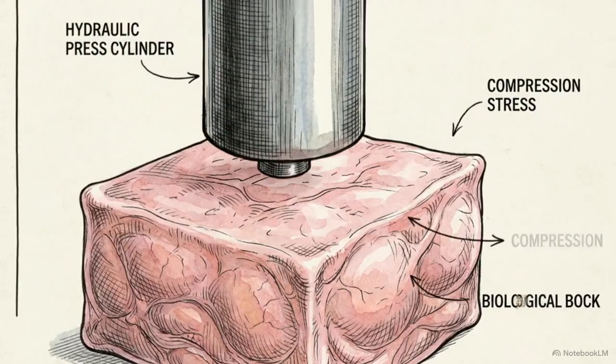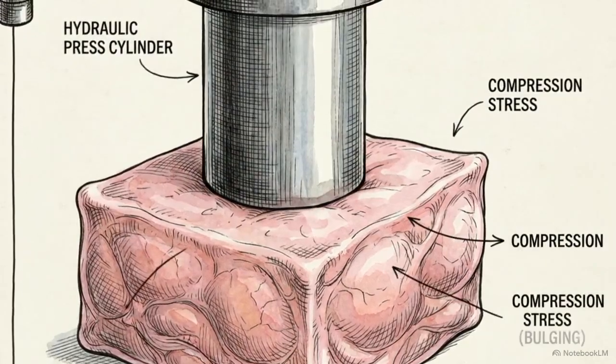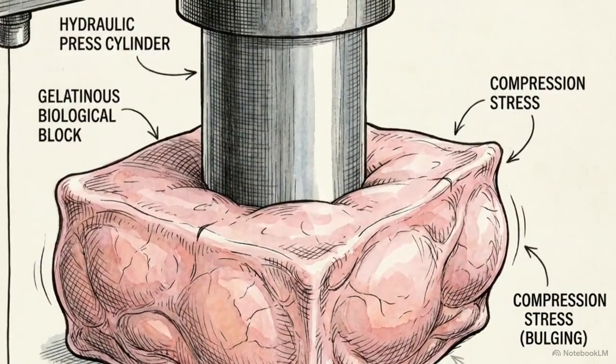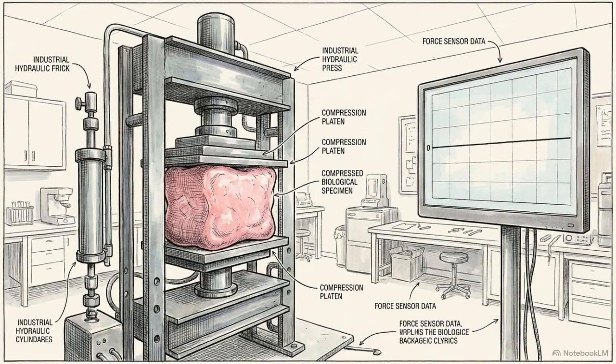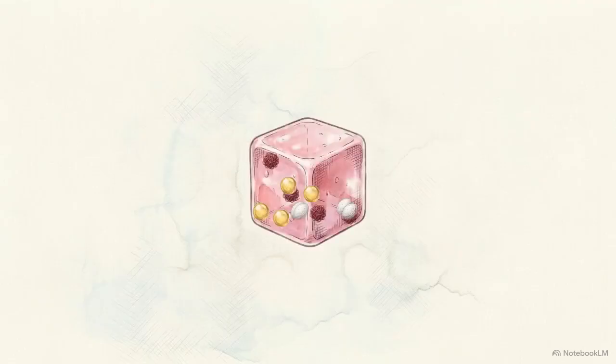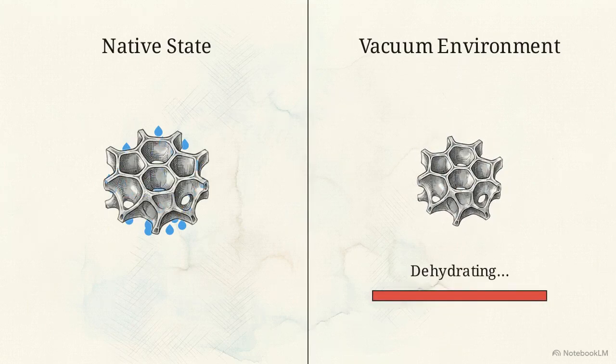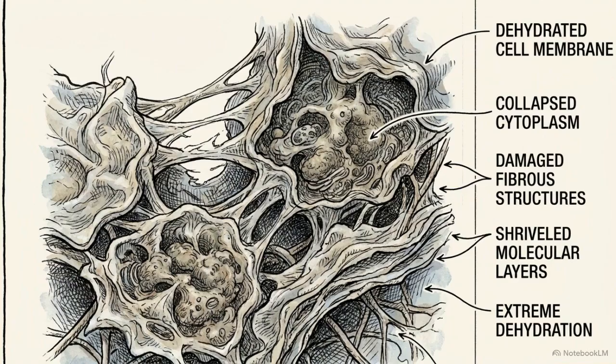Macroscopic physical properties, like a food's texture, stability, and digestibility, are strictly the result of its molecular-level structural organization. Bulk rheology tests an entire sample at once. It measures the average response, completely masking the nanoscale structural variations that actually govern the material's behavior under stress. High-vacuum electron microscopy provides a closer look, but it requires dehydrating the sample. This destroys the water-rich state of biological materials, rendering the structural data largely irrelevant to real-world conditions.